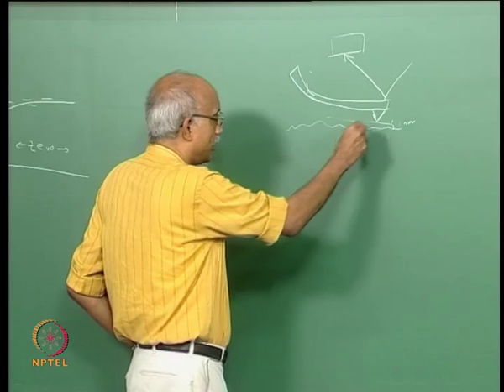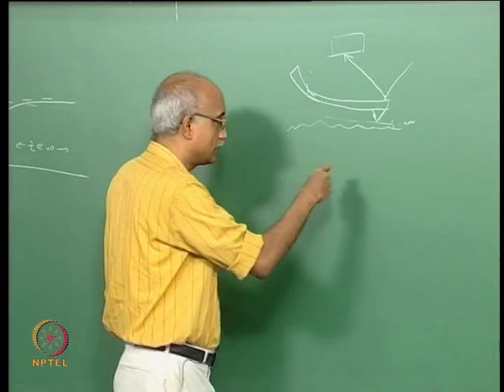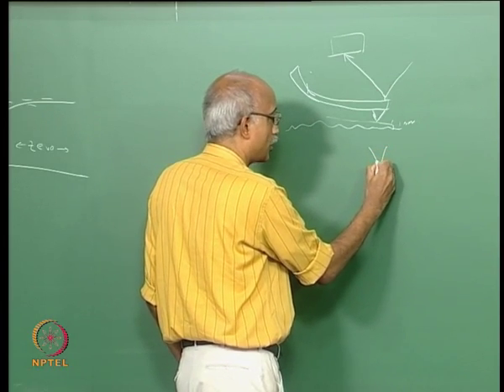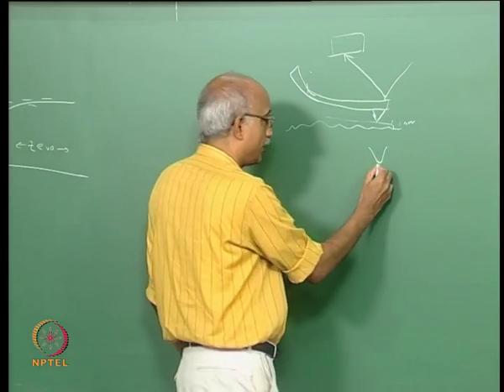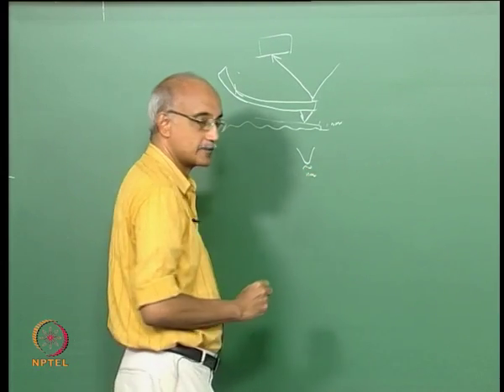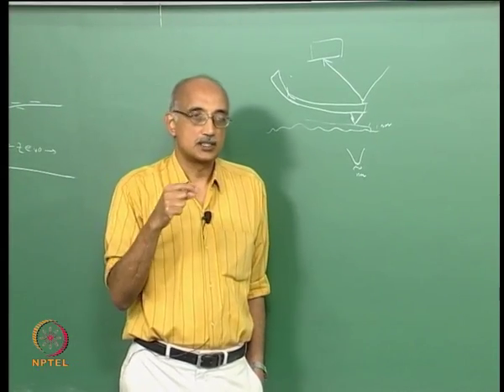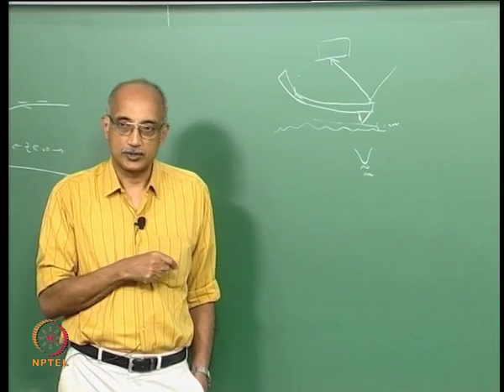The tip is obviously a very important constituent, and it has to be precision machined to nanometer dimensions. Actually, if you look at the tip closely, it does not have a sharp edge, it actually has a slightly rounded edge. It kind of looks like this, and this rounding radius again is of the order of nanometers or less. The smaller the rounding radius, the more sensitive and the higher the resolution that you can get from the atomic force microscope.